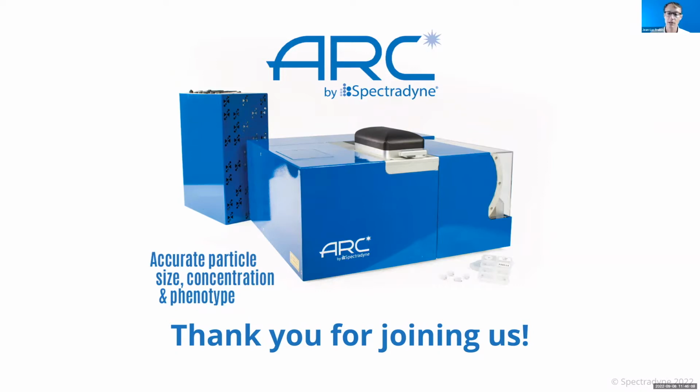There are lots of questions about GMP compliance, so let me just address those generally. GMP compliance, as I understand it, is a validation of a technology within the context of a particular workflow.